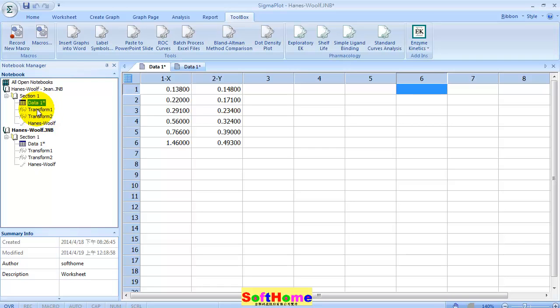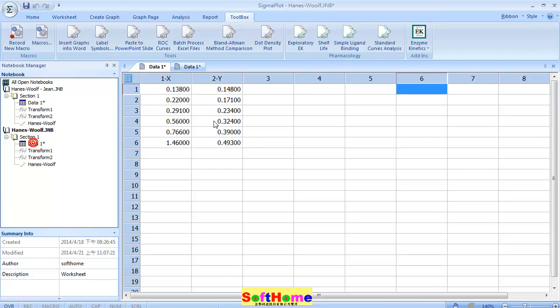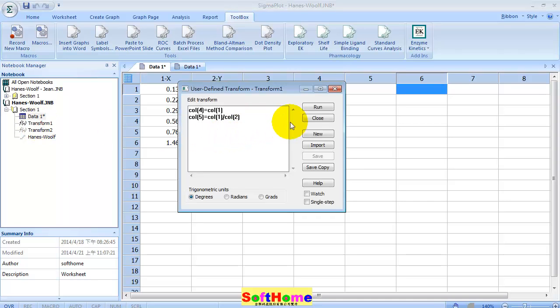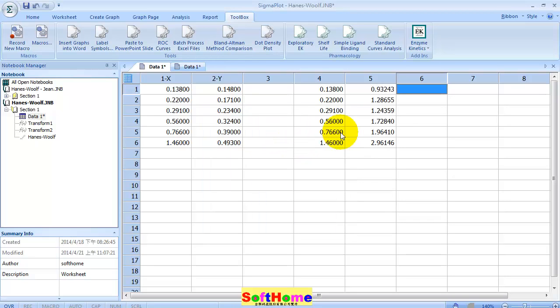This is the data from the paper. Now first use transform one, and select column four and column five. Press run.